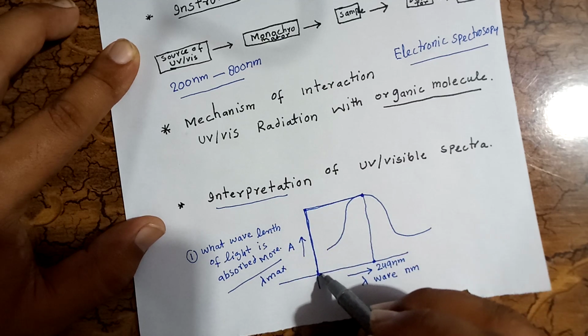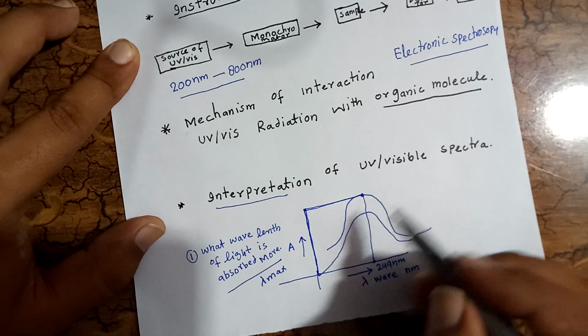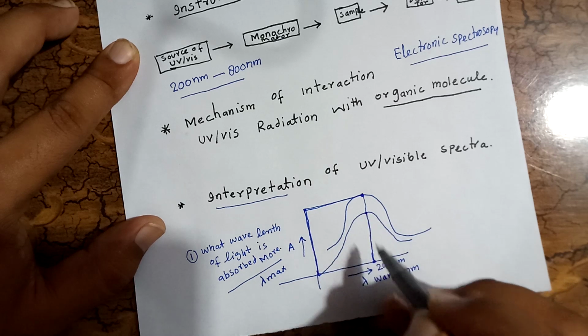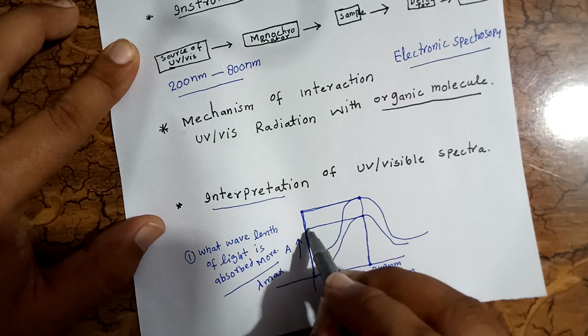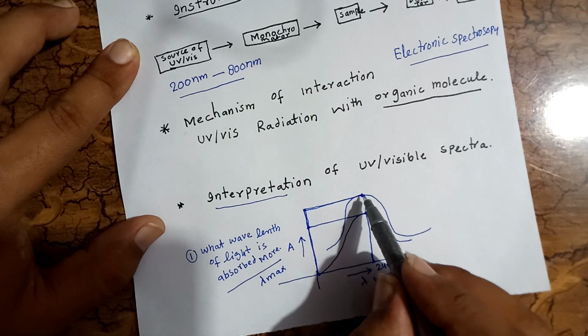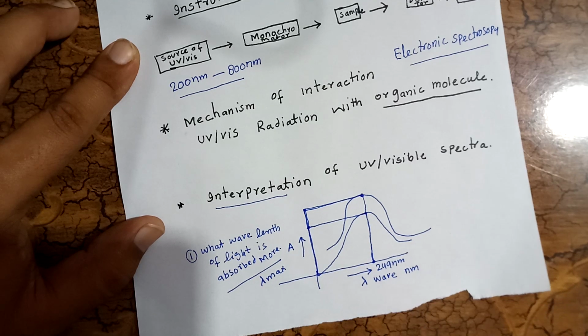If we get this kind of spectrum, here this is the lambda max 249, and it will come at the same 249. If the concentration of paracetamol is less, the peak is this; if the concentration of paracetamol is more, it is this; there will be no difference in the wavelength. So keep in mind the two things.